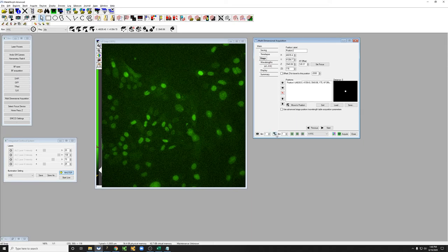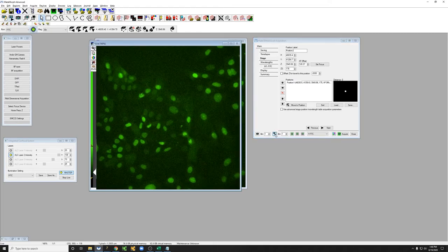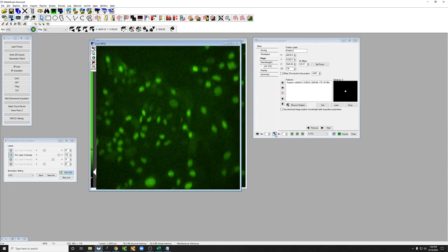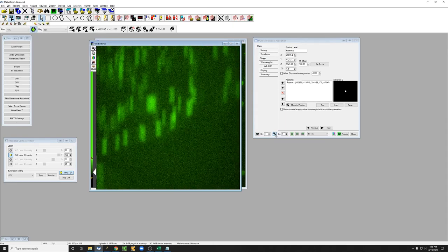And so how do we do that? Well we can navigate either by eye or with the live, so I'm just going to do navigation with the live. I'm going to go here, just going to move down a little bit.